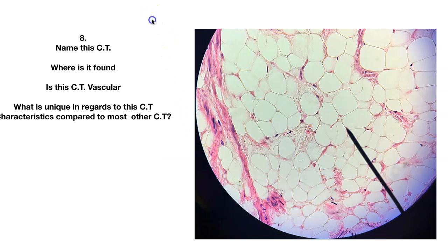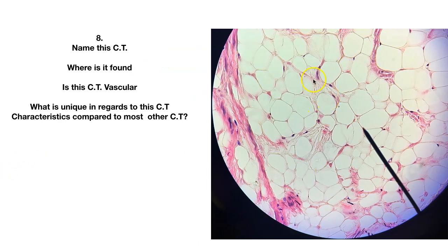This is what? This is adipose tissue, basically fat. These are vacuoles, they're just spaces. This adipocyte is a cell, it's just a space that holds fat. You can see the nuclei pushed to the edges of the adipocyte. Here it is. Here's a nucleus here, but basically these are just spaces to store fat.